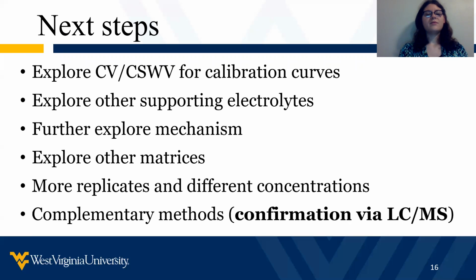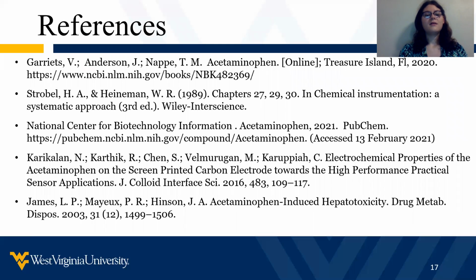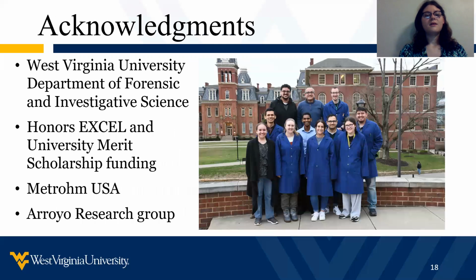We'd like to do more replicates for the tap water and the tablets, and look at more different concentrations for the tap water. And finally, since electrochemistry is a screening method, it's not the end of the story, so it'll be important to look at complementary methods and especially confirmation, so we will look at developing a confirmatory method with LCMS. These are my references.